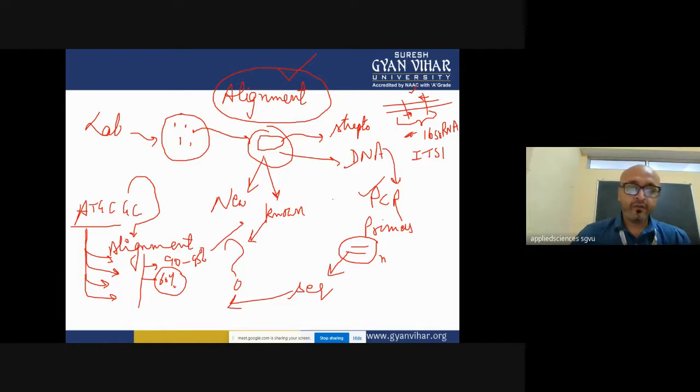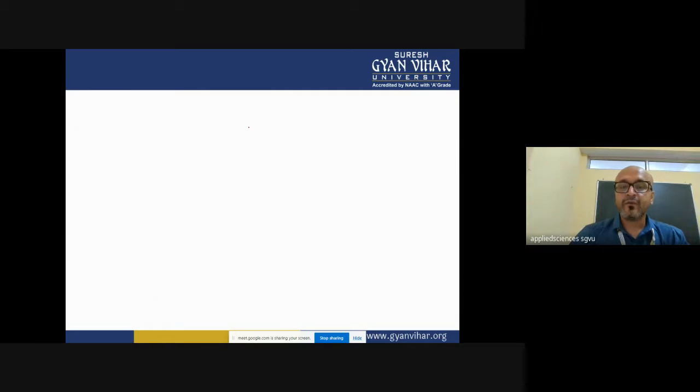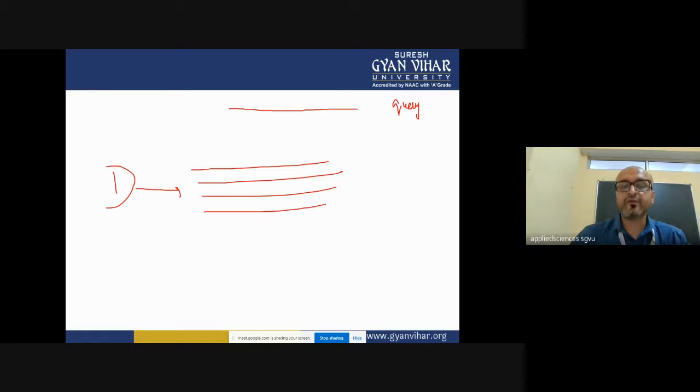So what do we do in alignment? Just to give you an idea, and I will not take much of your time. This is my query sequence, which I have taken. This is my database, which contains multiple sequences; for now, let's talk about 4 sequences.